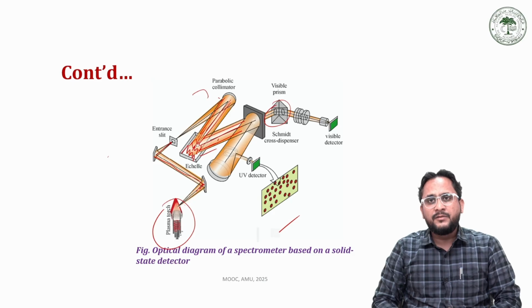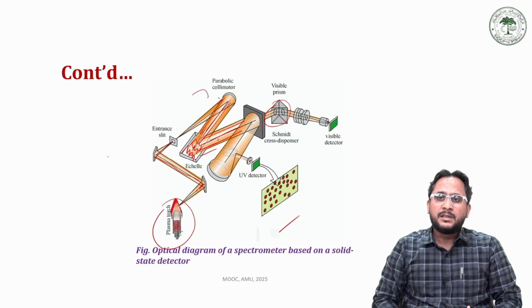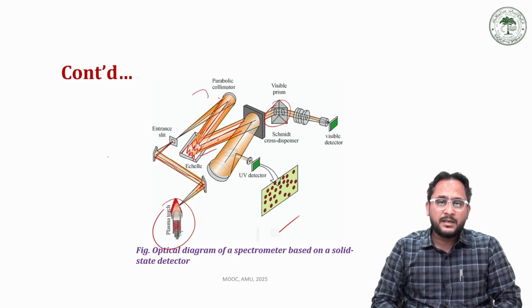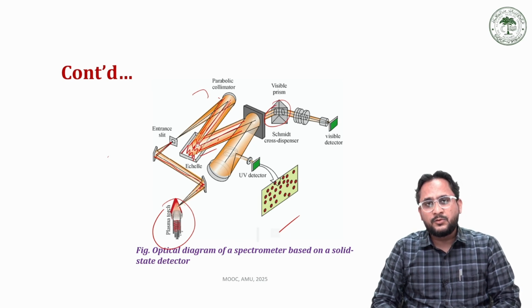So with this, we have discussed the different components of ICP, inductively coupled plasma, right from the beginning, that is the peristaltic pump, the nebulizer, spray chamber, the torch for creating the inductively coupled plasma, then the monochromator, the type of spectrometers that use monochromators like our sequential spectrometers, and the slew scan spectrometers that slightly reduce the time of analysis.